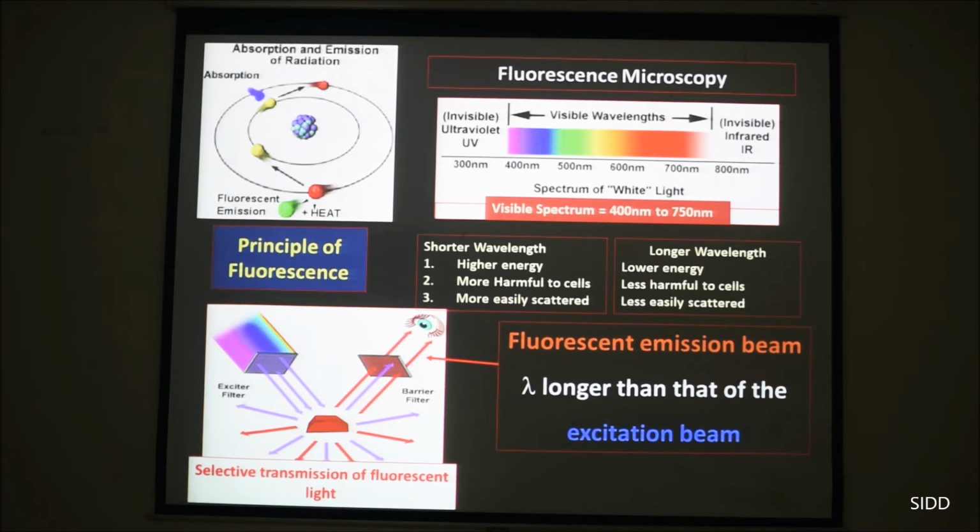Certain molecules by themselves, even biological molecules, have the property of fluorescence, but certain other molecules, organic and inorganic, can combine with various molecules in our cells and give them fluorescence property. They can be chemically synthesized, or they can be natural products, like quinacrine, which was one of the earlier natural products used as a fluorescence component, because it will bind specifically to DNA, and therefore it was a chromosome fluorochrome. Quinacrine is the drug that is used for malaria treatment.